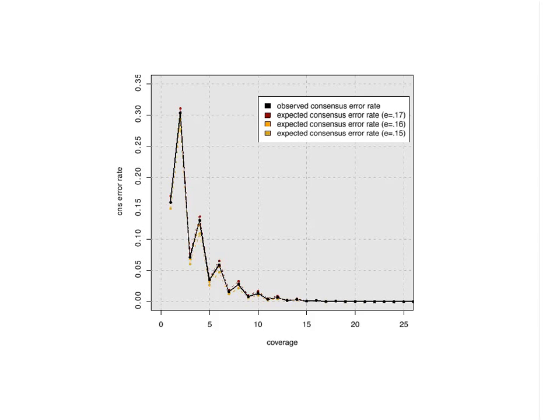So if you're doing a large genome project like that, you should really try to secure access to a compute cluster to do the correction phase. We're working on speeding up as much as possible the aligning and the correcting of the PacBio reads, but for those large genomes, you do require some server size.